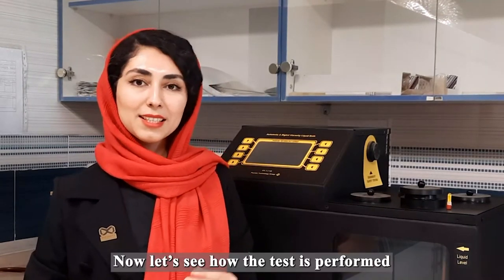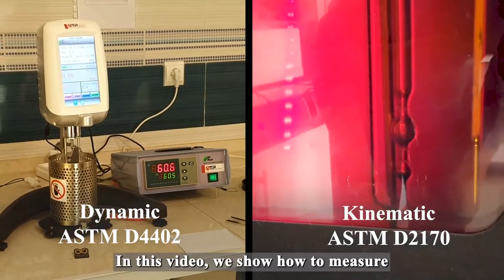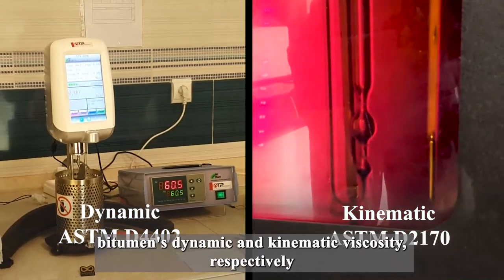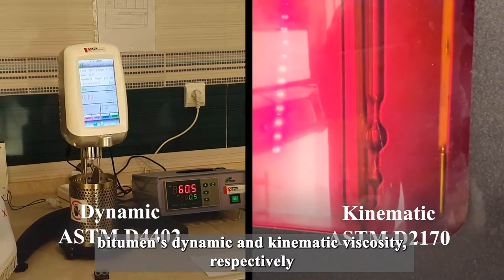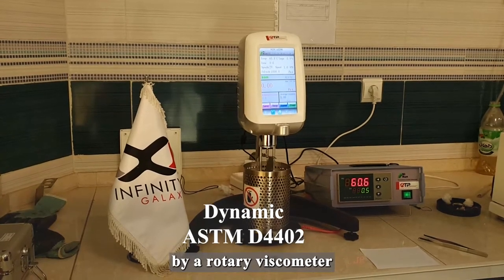Now let's see how the test is performed. In this video, we show how to measure bitumen's dynamic and kinematic viscosity respectively. Number 1: Measurement of dynamic viscosity by a rotary viscometer.